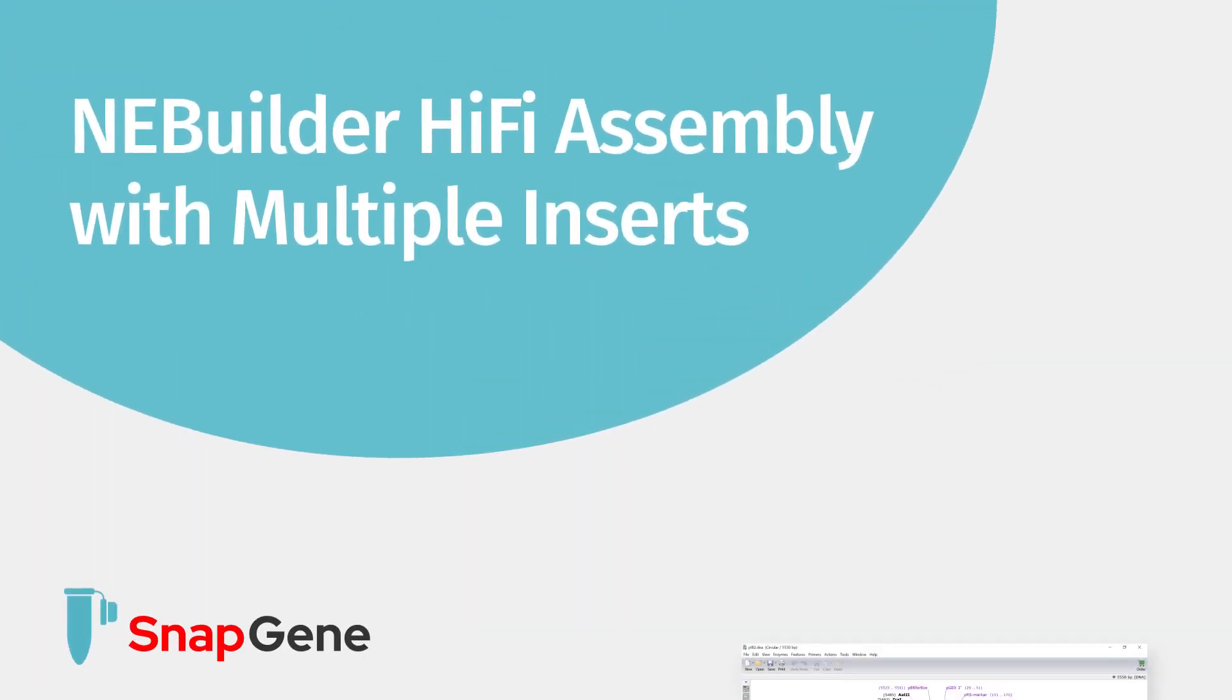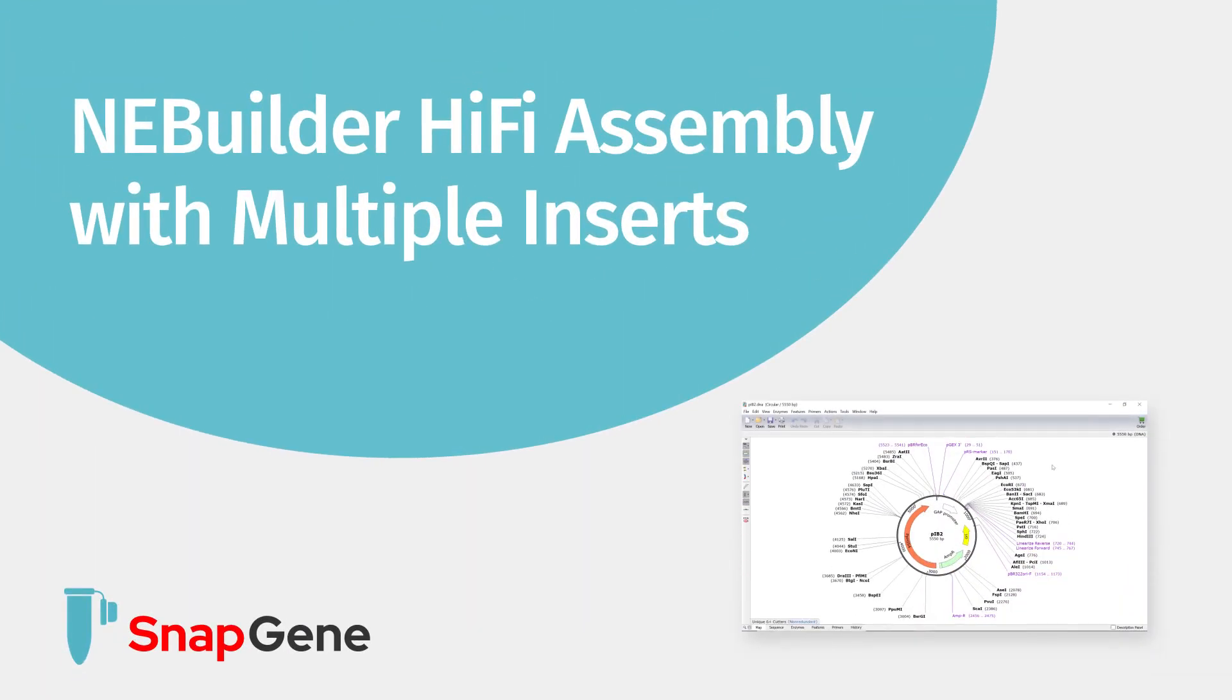In this tutorial I will show you how to simulate NEBuilder HiFi assembly with multiple inserts in SnapGene. To learn how to simulate a simple assembly with a single fragment, check out our other tutorial.